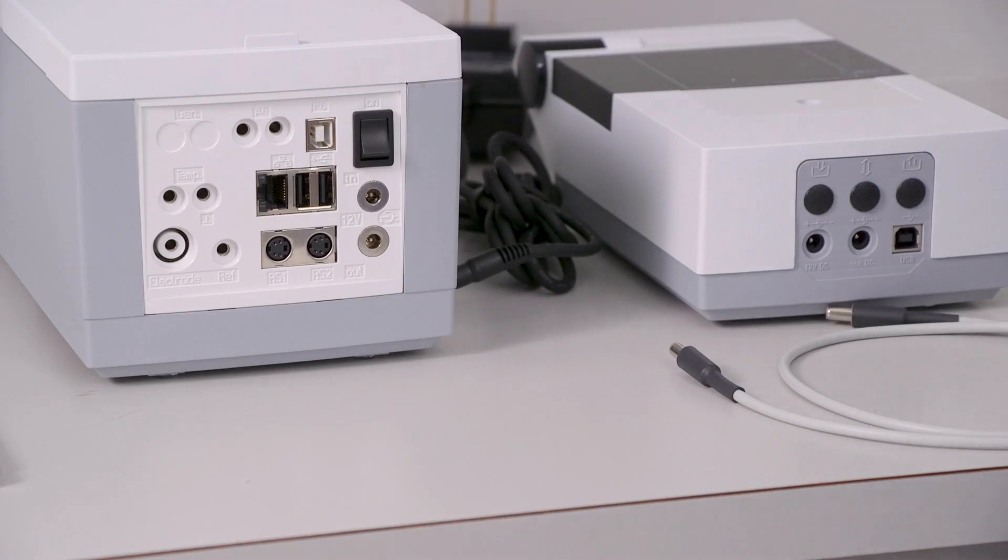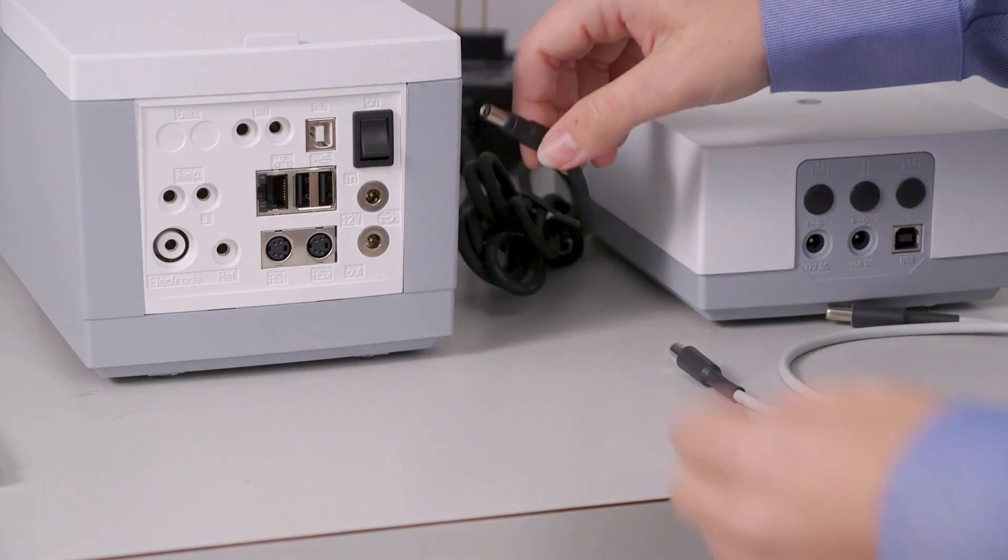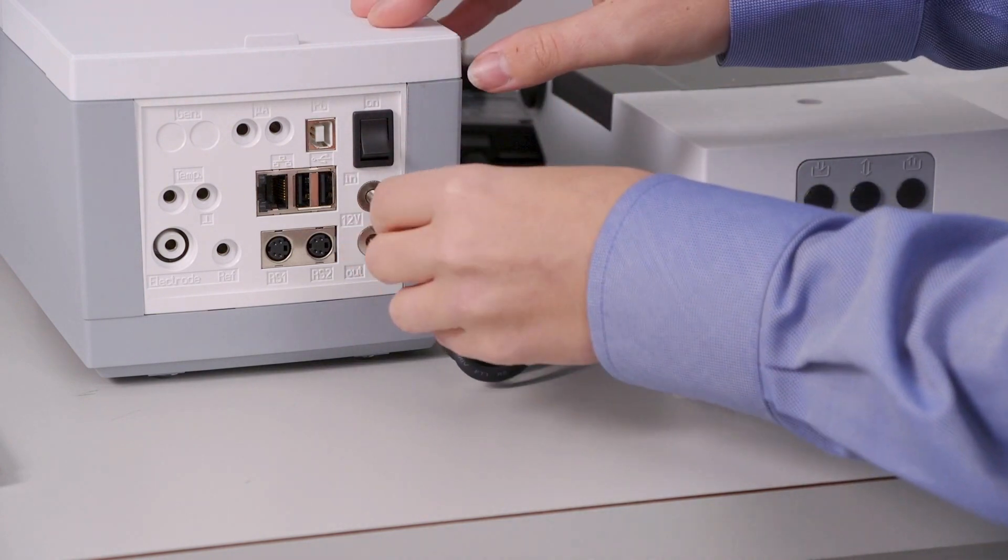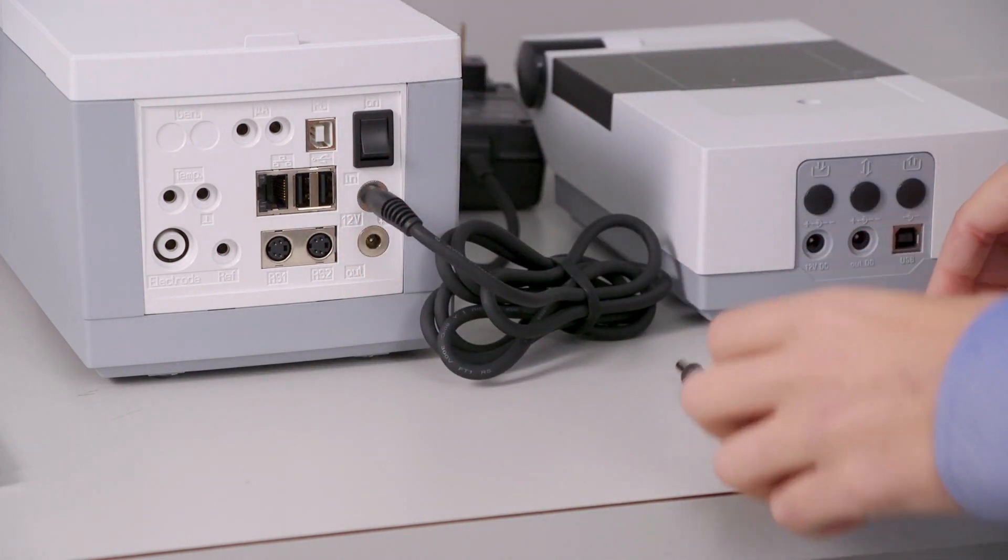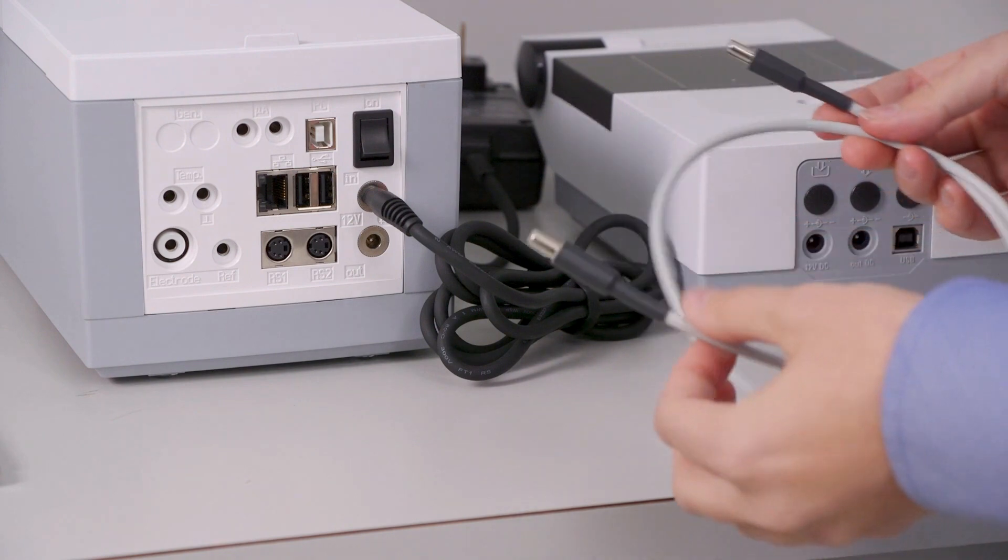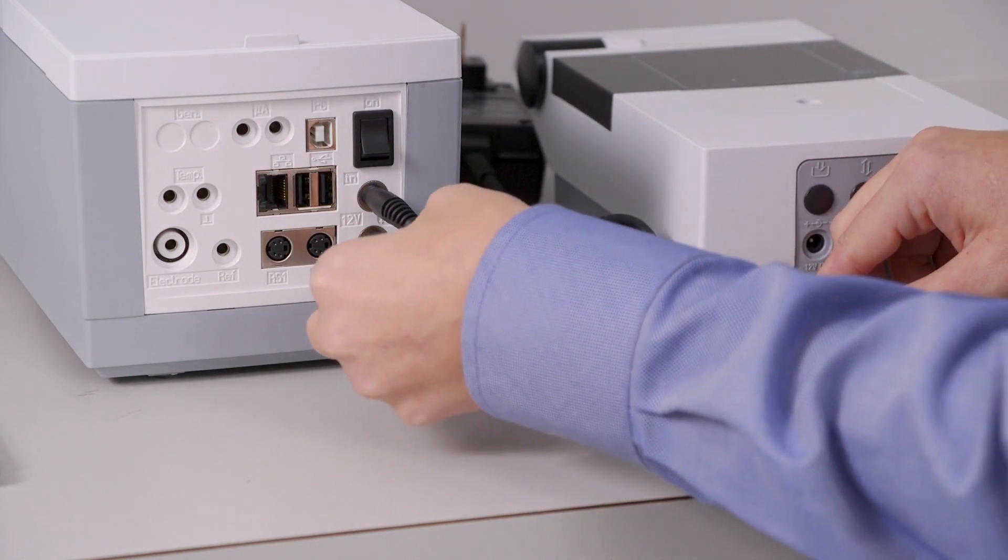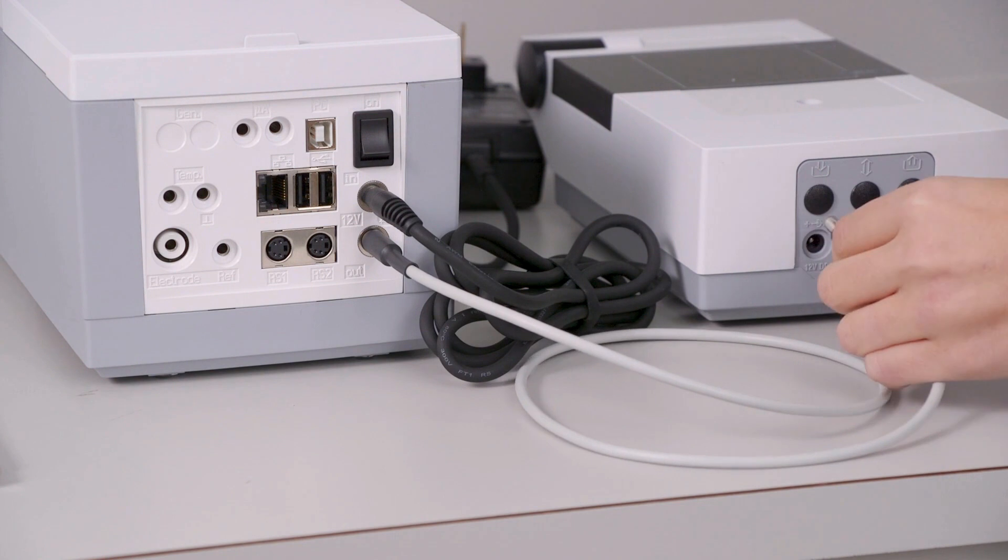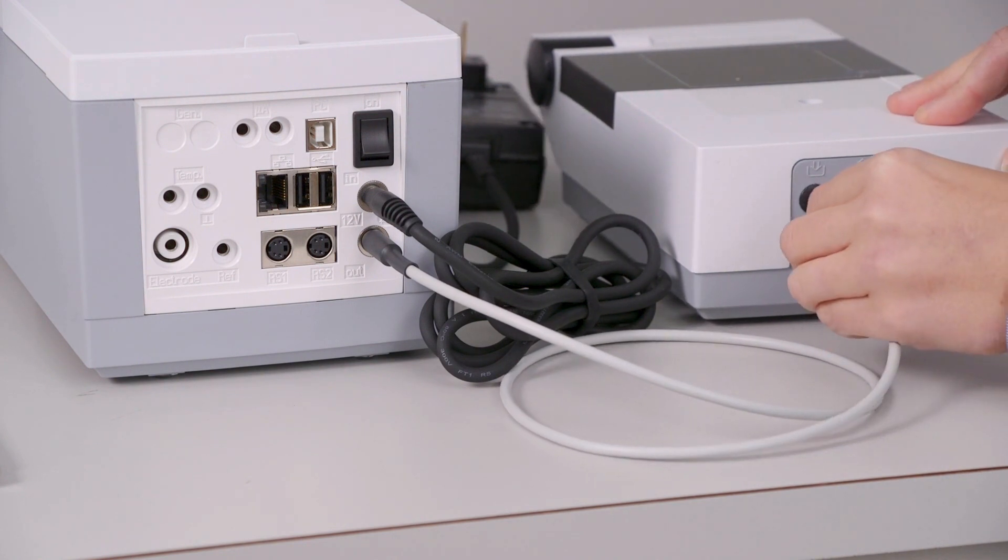We're going to take a look at the back panel of the Titrator. The main power supply will get plugged into the in 12 volt port. The magnetic stirrer cable will get connected by one end into the out port here, and the other end into the in port of the magnetic stirrer.